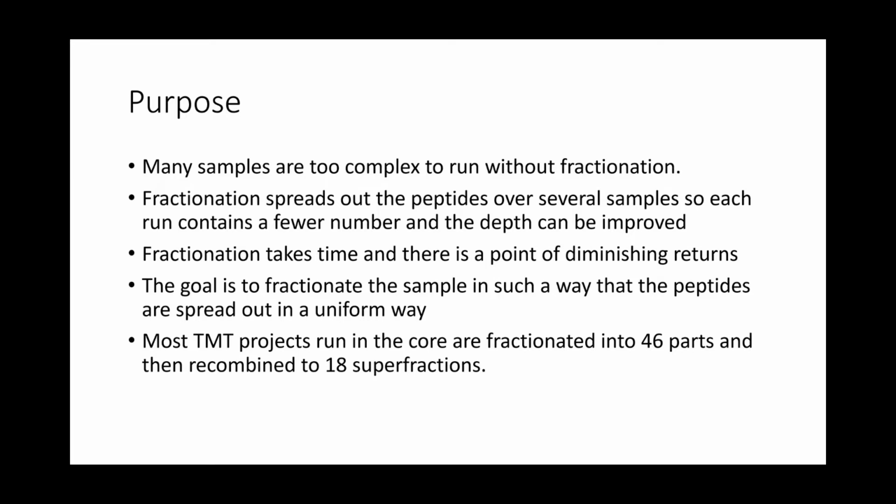So the best way is to spread out the peptides so that we can analyze those and get better depth. Fractionation spreads out those peptides so each run contains a fewer number and depth can be improved.